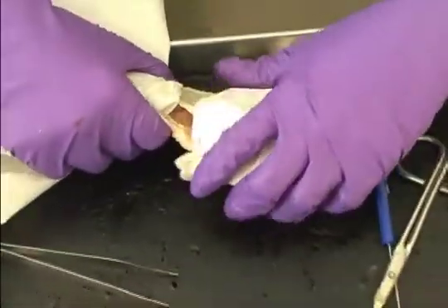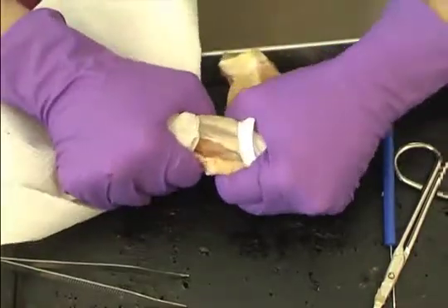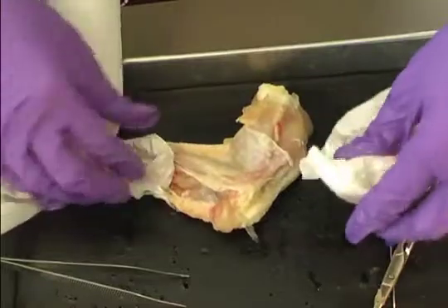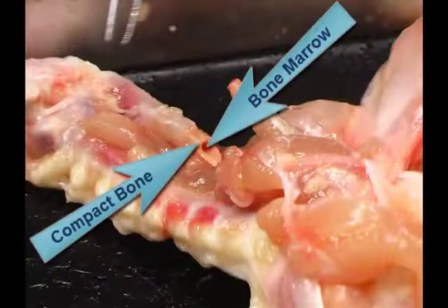Then break one of the small bones in the lower chicken wing. It is easiest when holding the bone with a paper towel for a better grip. Be careful to avoid the broken ends of the bone as they may be sharp. Observe the structure of the bone, noting the hard, compact layer and the bone marrow within the bone.